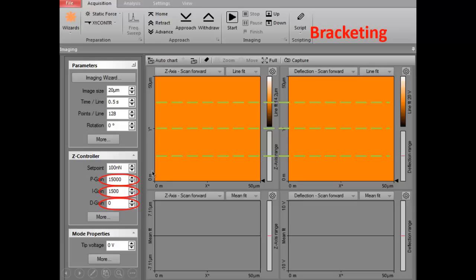For bracketing the PID gains, at least one of your four areas should show poor quality due to bad choice of PID gain value. And for the I gains, you should show at least one bad area with I gain too low and one bad area with I gain too high.